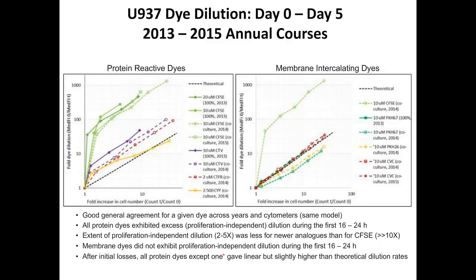And if you look at that curve a little closer, you'll see that in essentially the first day, that decrease is at a much higher rate than the decrease that you see at subsequent days. That's true if you look closely at all the other protein dyes, that there's a different kinetics to the loss of dye in the early stages than there is in the subsequent stages.